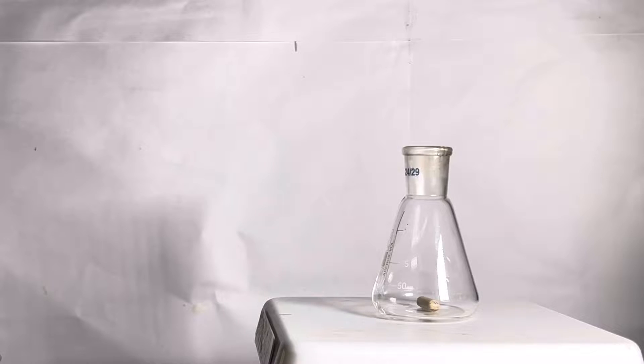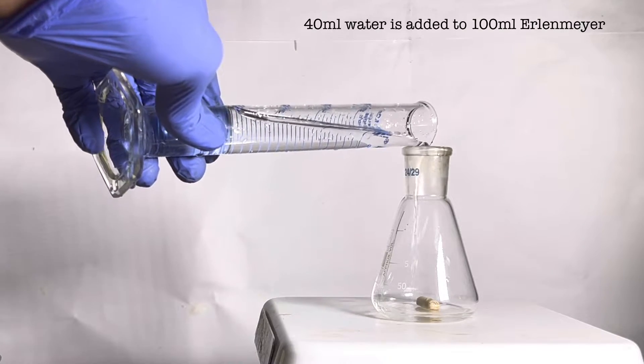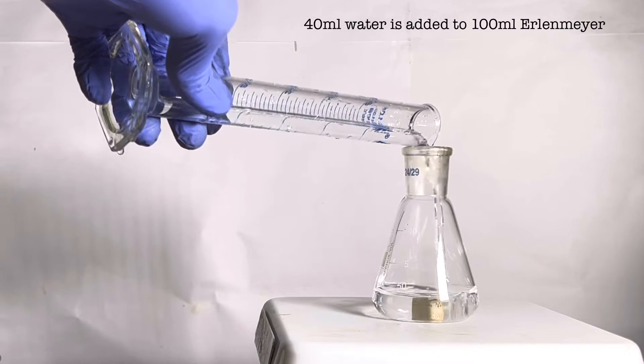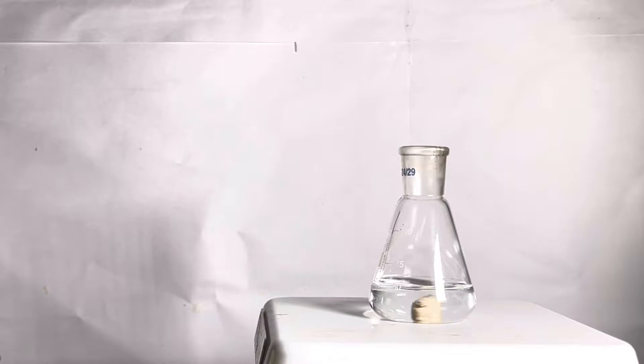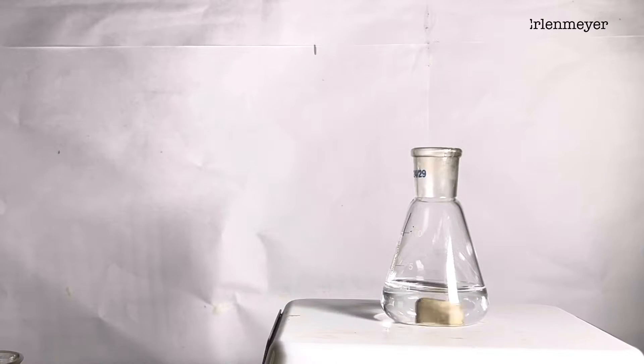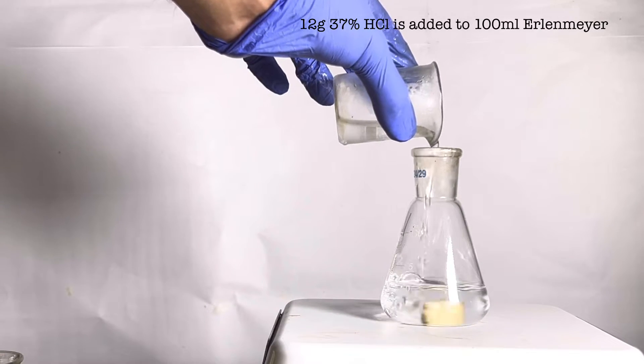Start by placing a 100 ml Erlenmeyer flask on a hot plate stirrer with a stirring bar inside. 40 ml of water was added in it. Stirring was turned on and 12 grams of concentrated 37% hydrochloric acid was added to it. This would make a dilute solution of hydrochloric acid.